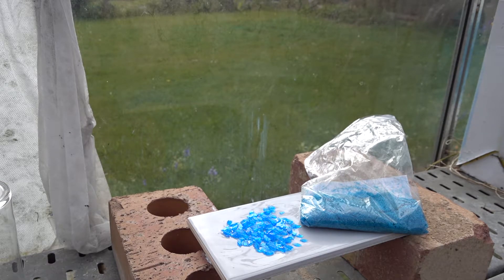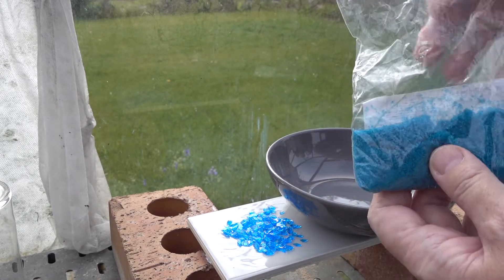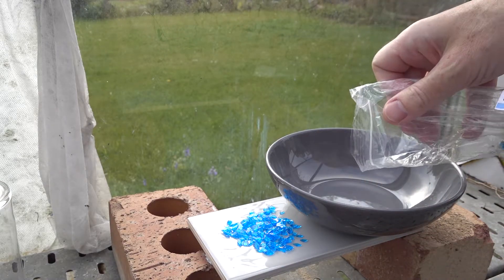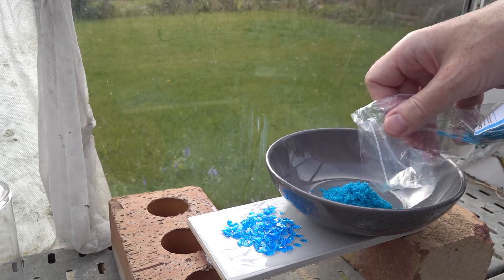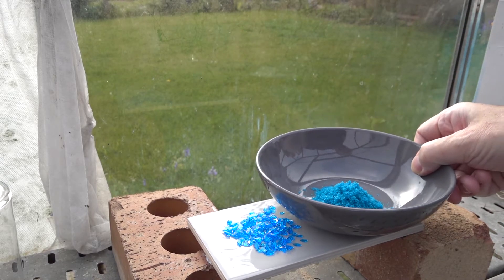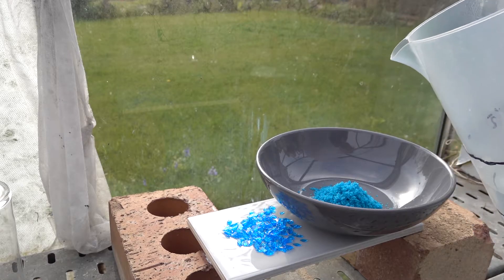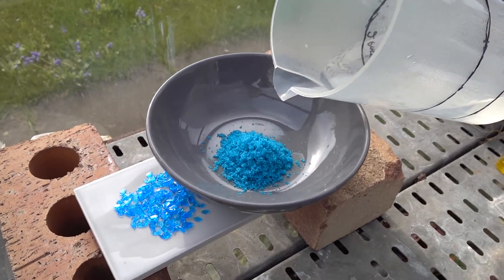In order to do that, we need to dissolve it in solution, and we can do that in the bowl here, although it's not the ideal piece of apparatus. So we pour about 50 grams or so — half of what we got — into the bowl. We can then dissolve that in very hot water, which I've got here in the jug. So we just add some to the copper sulfate.